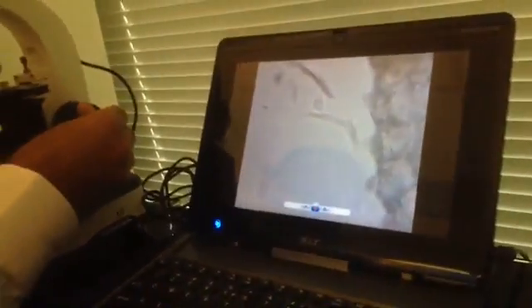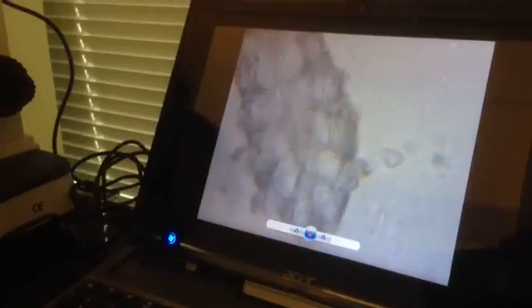It's very naughty! These are the eggs — my goodness, so fast, it doesn't let me follow it. Oh, I think I lost it... oh, here! You can see the sharp mouth and the legs. It's good we don't even need to touch the microscope because the damage is working the whole thing. And now we can see the eggs.